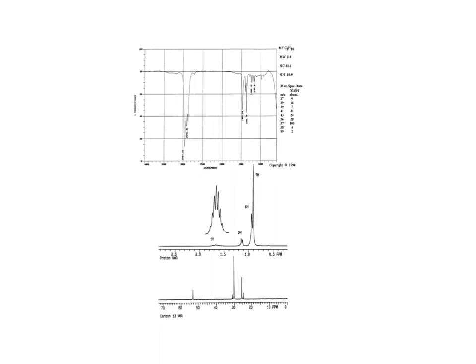Okay, so I'm going to go over really quickly what I'm expecting for you guys to do in the spectral analysis lab. If you download the student handout, there's no instructions, there's no procedure. Essentially, what I'm trying to get you guys practice and experience doing is taking IR data, taking NMR data, and essentially producing the overall structure, right?